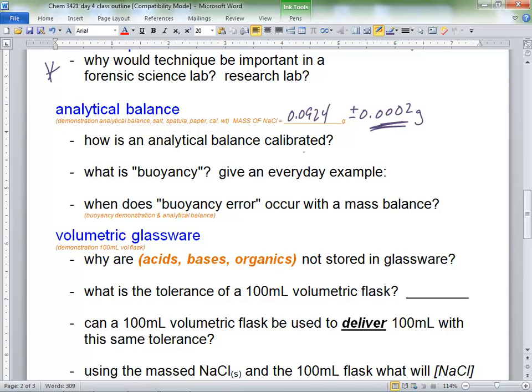So whether I find the mass of the empty syringe like this, or I find the mass of an empty syringe. Let's see. There's a hole. Let's see. Like this. Shouldn't matter, right?